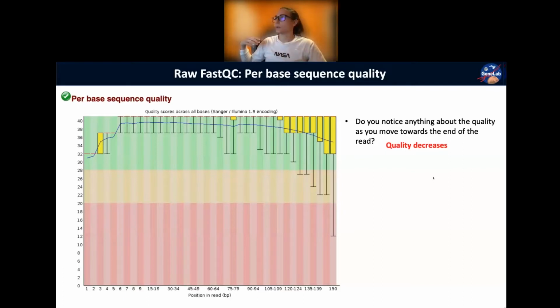And then to your point, Chief, remember each of these nucleotides is tagged with fluorophores. Once you put those fluorophores into the reaction, they can start to degrade over time as well, so you might not get as strong of a signal. The other reason is depending on the diversity of your library. As you're going, it's incorporating the base pairs as it goes.